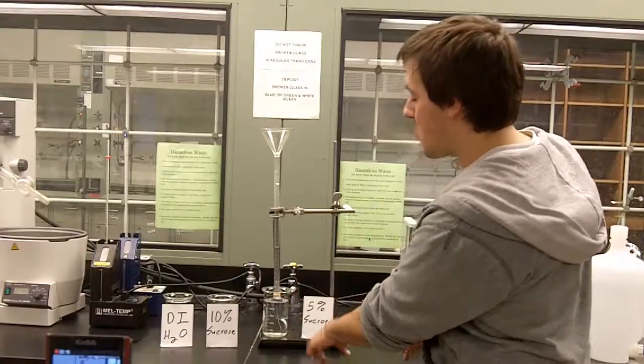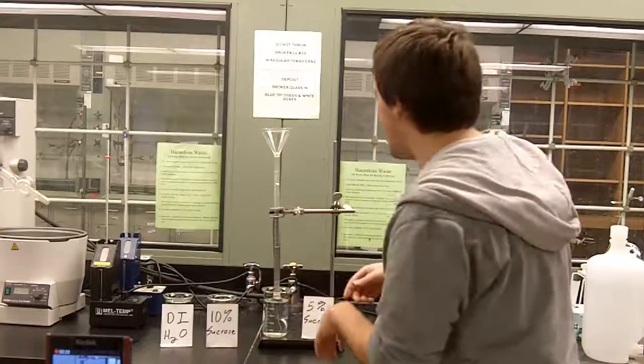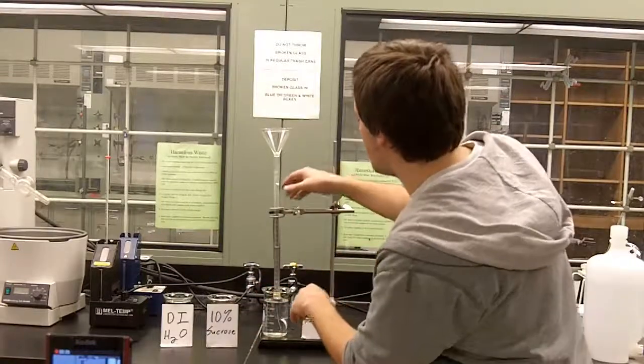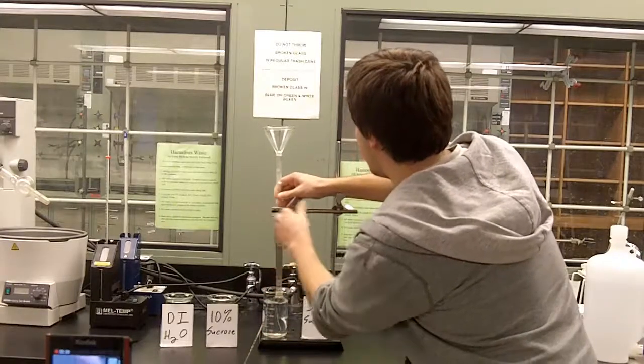So today we have a 5% sucrose solution, a 10%, and then water with no sucrose in it. The water level should move when we switch. Try to predict which way you think it's going to move, having that basic definition of osmosis.